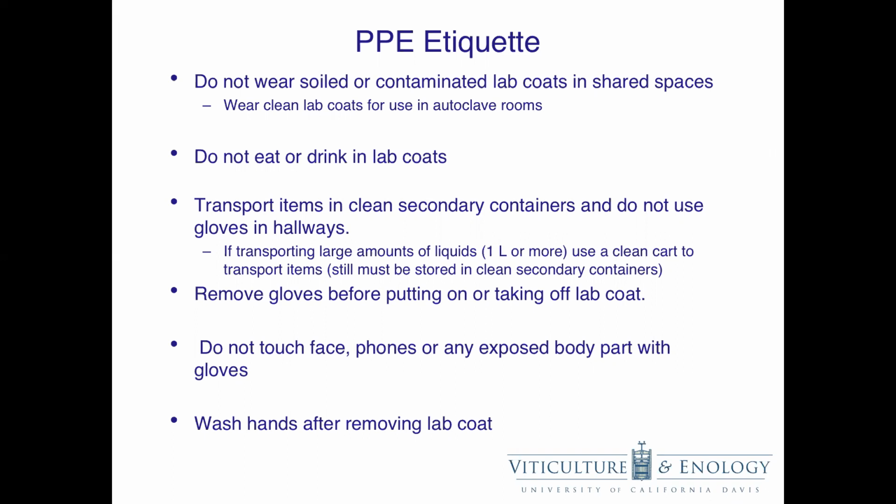Do not touch your face, phone, headphones, or any exposed body part with gloves. Doing so can contaminate your skin or personal items with any of the hazards you have on your gloves.